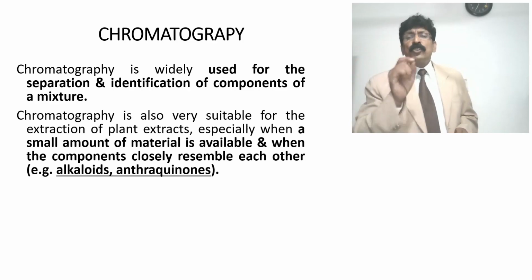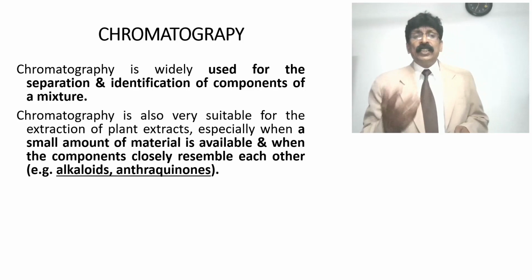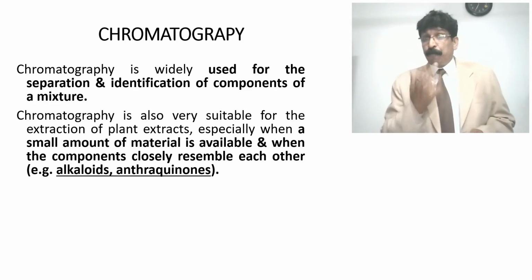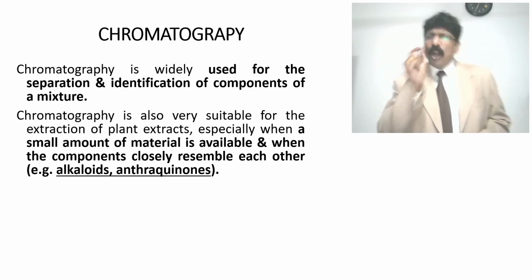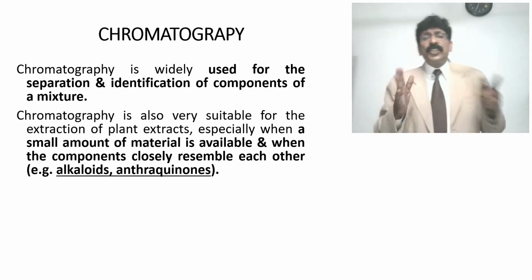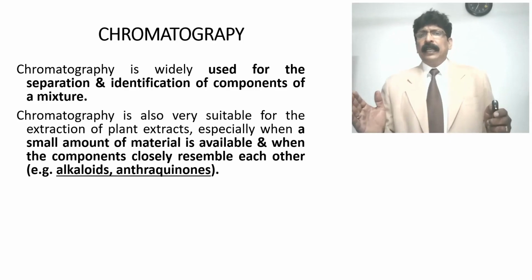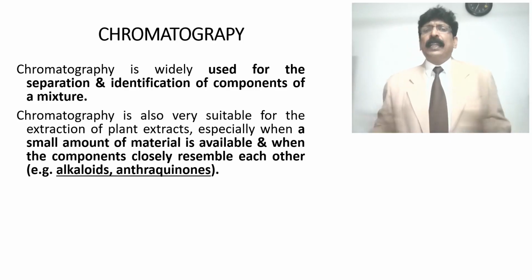Chromatography is also very suitable for the extraction or isolation of plant extracts, especially when only a small amount of material is available and when the components are very close and resemble each other, slightly different in structure or in physical character.